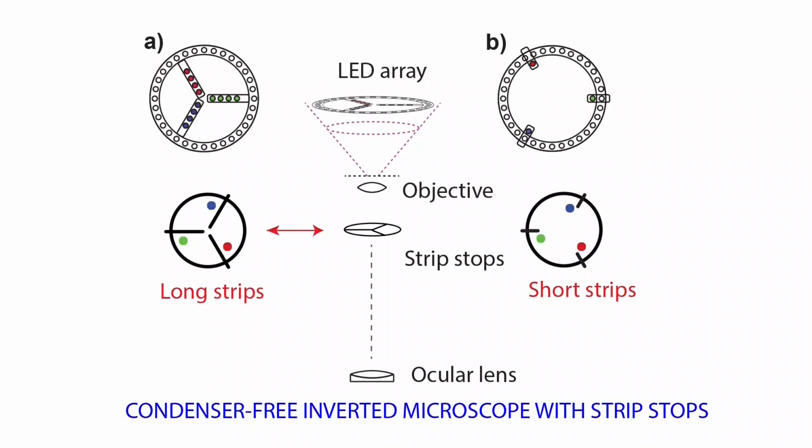Here are some proposed modifications for condenser-free microscopes that can superimpose internal dark field images. This requires a conjugate relay system. The layout in the right panel is intended to create images in red, green and blue that each have maximised directional resolution in unique directions that are separated by 120 degrees. This gives 3 sharp images undegraded by lower resolution from the other colours. These can be bright field or dark field or hybrid, depending on the positioning of the Fourier stops.